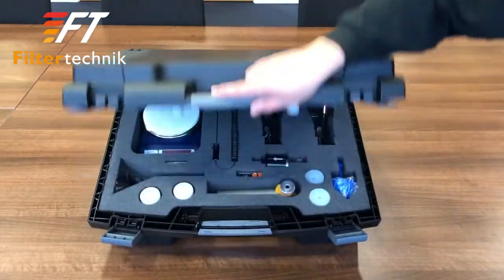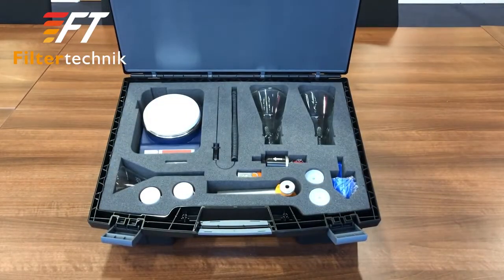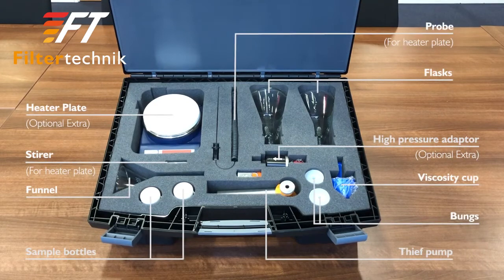This is the accessories case. This includes the flasks, viscosity cup, bungs, sample bottles, thief pump and optionally the heater plate with the stir and probe and the high pressure adapter.